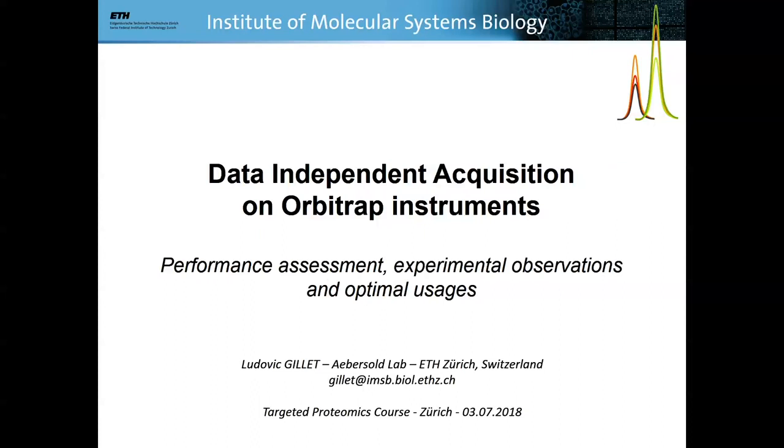So last year we realized people were interested in the differences between time of flight and Orbitrap, and we mostly had experience with time of flight. So this is what we talked about a lot, and people wanted to hear more about Orbitrap, but also the differences between these. And I thought it would be cool to have a talk that went into those details a little bit. And then we realized there weren't actually that many people around who had done DIA on both mass analyzers, and so Ludovic is one of these people. So I strong-armed him into giving a talk about it. So Ludovic, I'm sorry. Please go ahead.